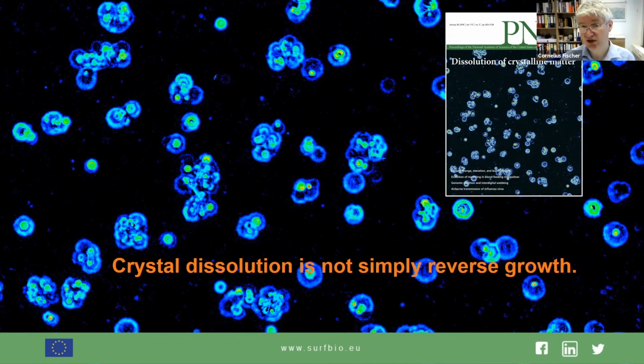And by using this kind of technique, and that's the last point of motivation that I want to show you, there's one conclusion that is not that obvious. One important conclusion is that crystal dissolution is not simply reverse growth, something not too many people would assume up front. But by utilizing this kind of surface-sensitive data, you are able to dig a little bit deeper and revisit the question of pore research.